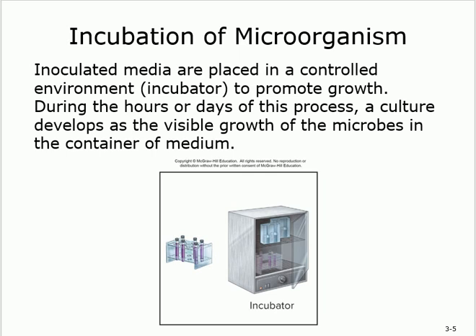How long should you leave it in the incubator? It depends on what you are studying. There are certain species that will take hours, a couple of hours, and that's it. Others will take days. And then you are going to look at it with your eyes and see the changes happening.